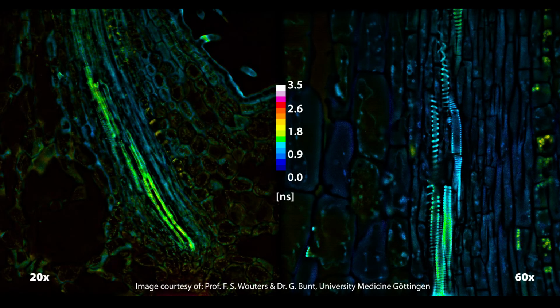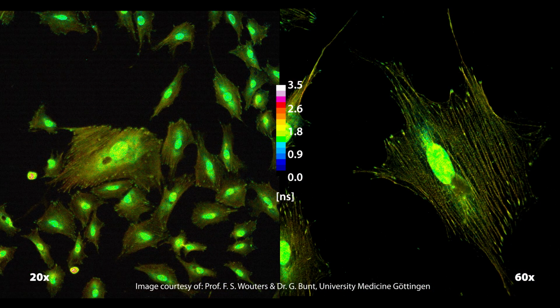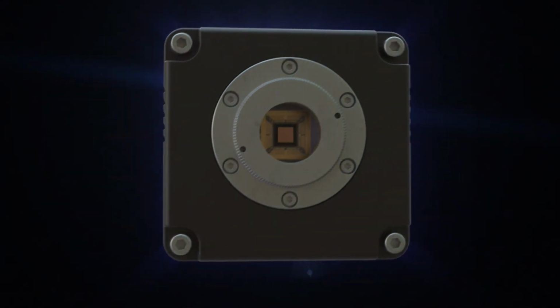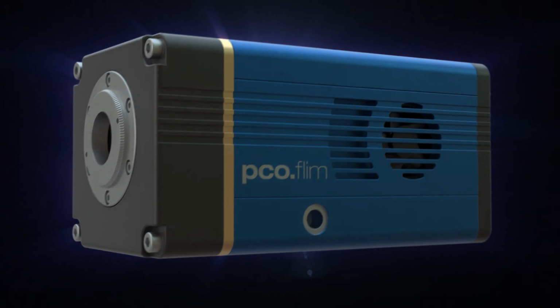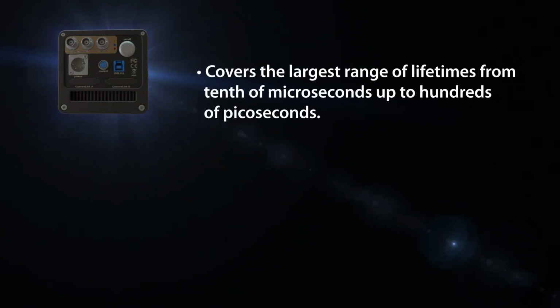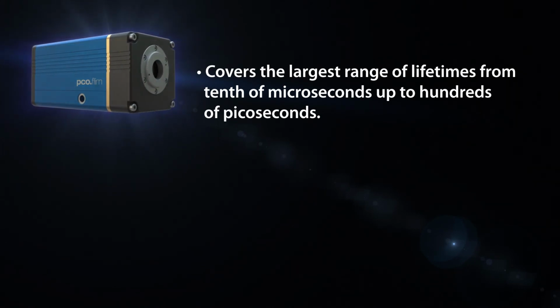So this is what makes the PCO FLIM camera a versatile frequency domain FLIM system. It can be used for the measurement of a huge range of luminescence lifetimes from tenths of microseconds down to 100 picoseconds. The PCO frequency domain FLIM system is best in its class because it covers the largest range of lifetimes from tenths of microseconds up to hundreds of picoseconds.